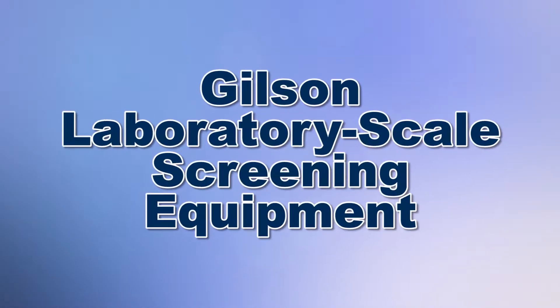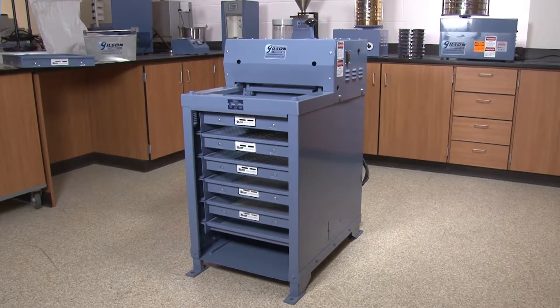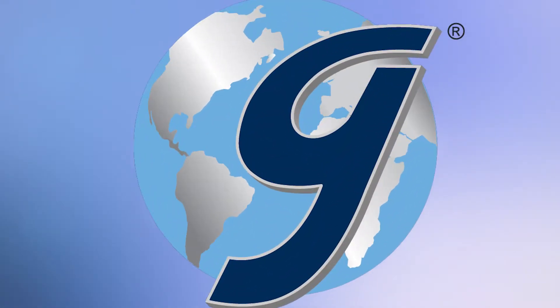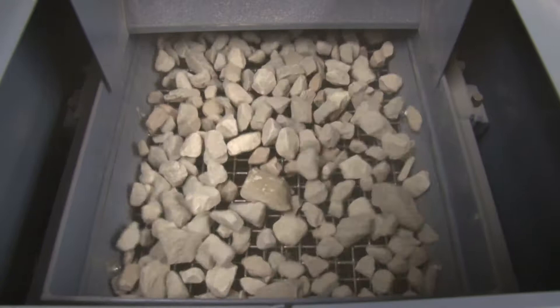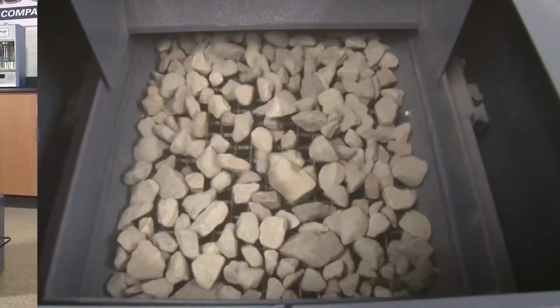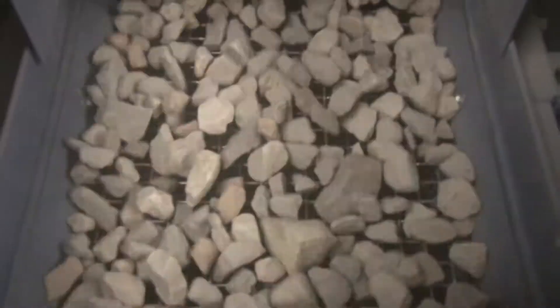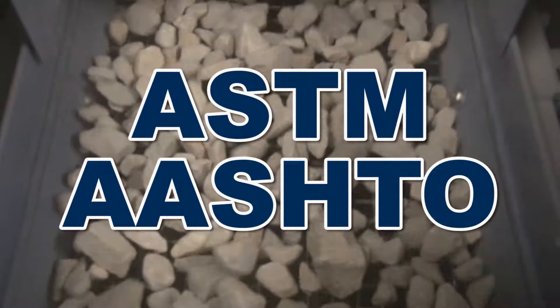When you need to accurately perform particle size determinations of large samples, Gilson is your best choice. Gilson screening machines are the gold standard for separations of large samples or coarse particles, and Gilson offers a variety of screening machines designed for your specific particle size determination needs, ensuring that your screening is compliant with ASTM and AASHTO standards.